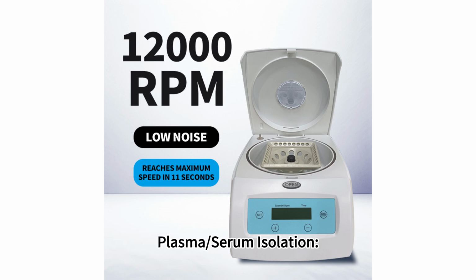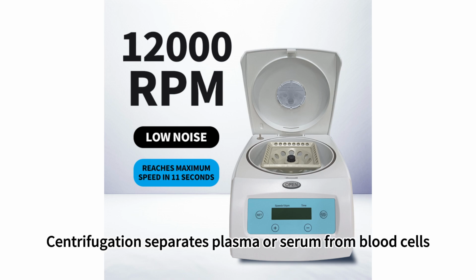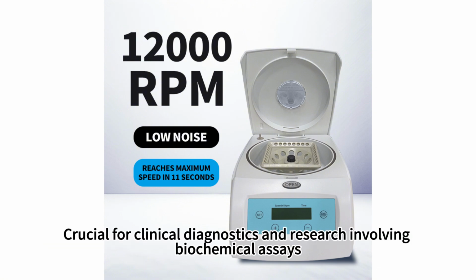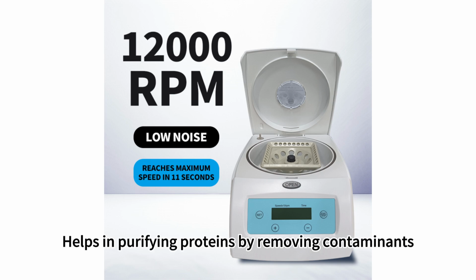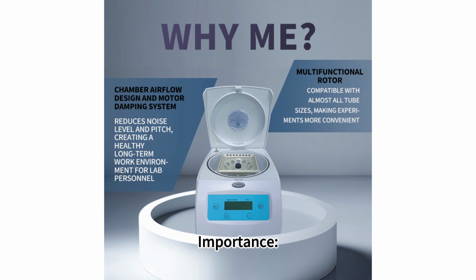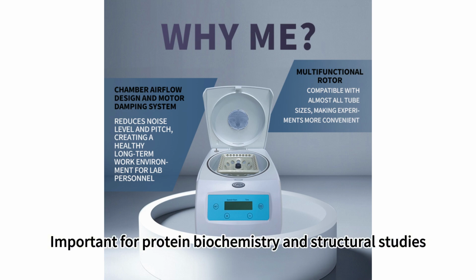Plasma, serum isolation. Description: centrifugation separates plasma or serum from blood cells. Importance: crucial for clinical diagnostics and research involving biochemical assays. Protein purification. Description: helps in purifying proteins by removing contaminants. Importance: important for protein biochemistry and structural studies.